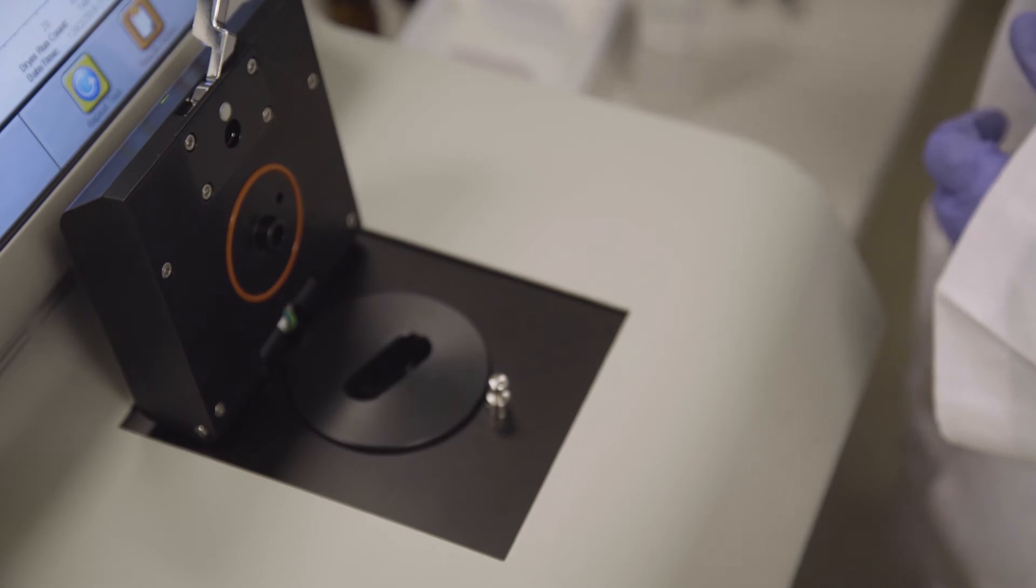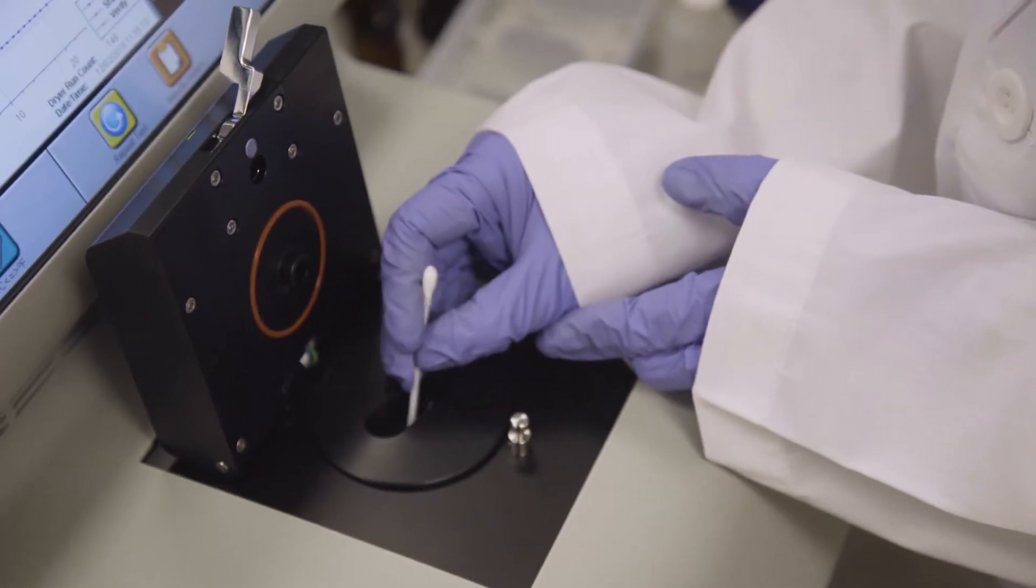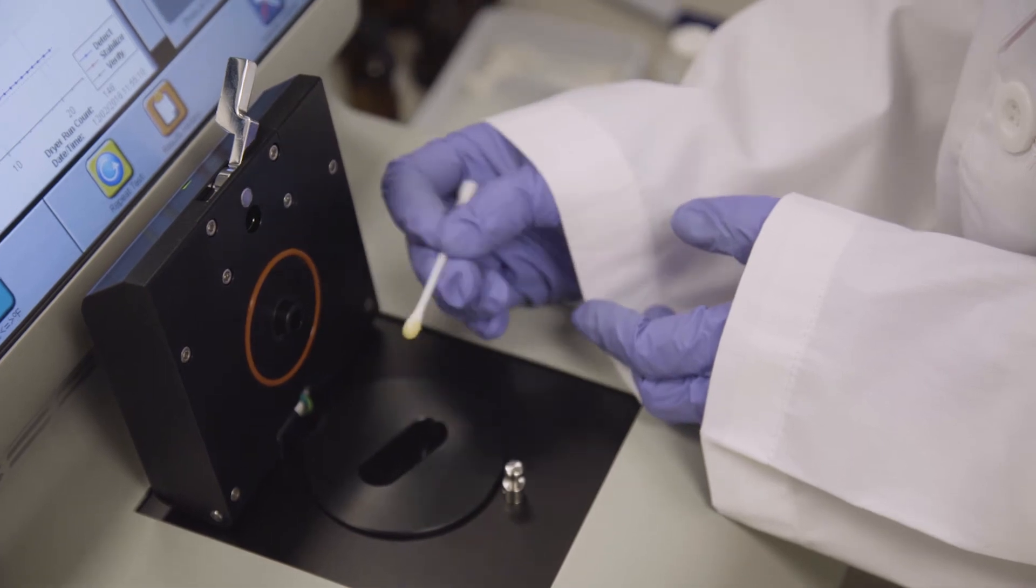To remove viscous samples such as base oils or lubricants, first remove the sample and dry the sample cup with a clean cotton swab.